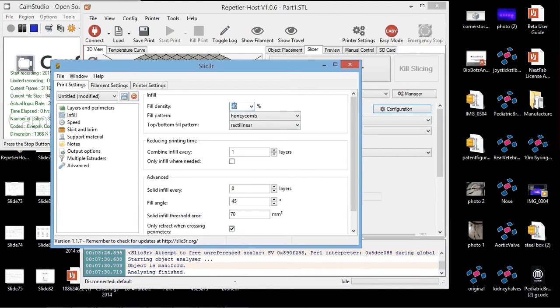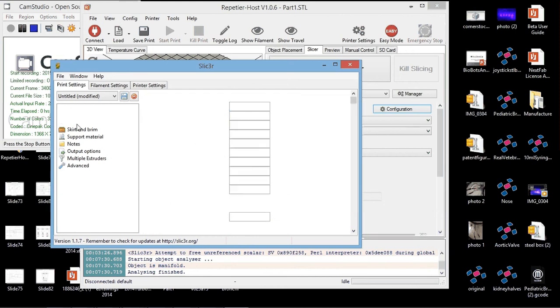The infill, so this is something you can also play around with, but fill density, you're going to want it at 99 just to start off with, and that's just because most structures you just want to print solid, and playing around with fill patterns, especially in bioprinting, should be very interesting. But I think the simple way to start is just having a full 99% fill density.